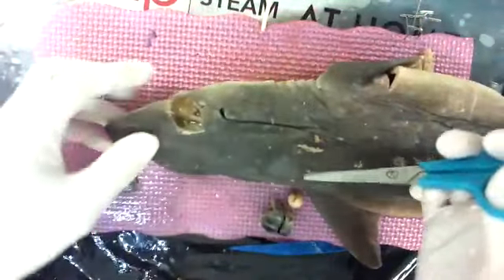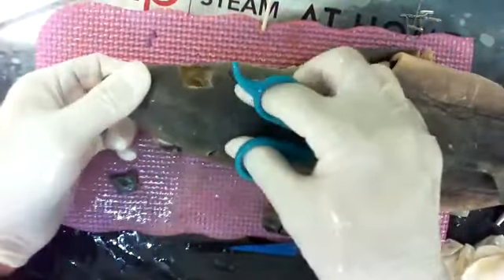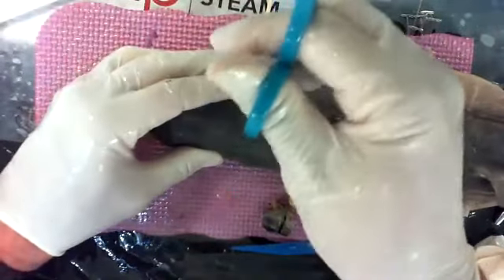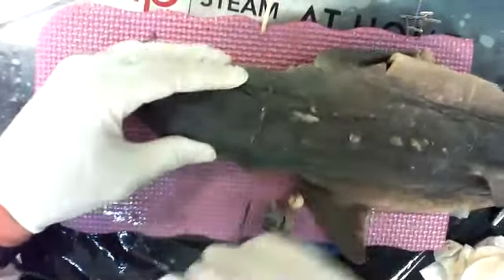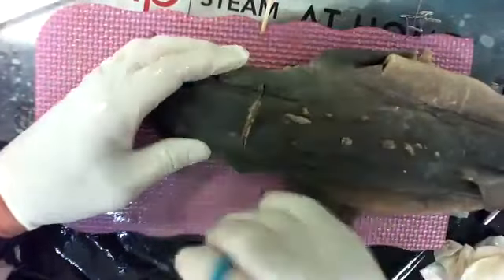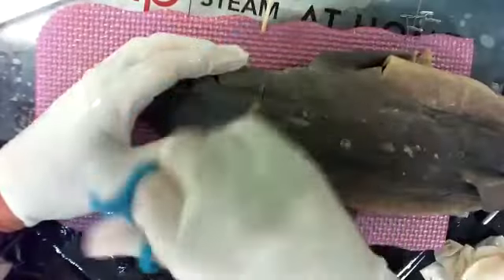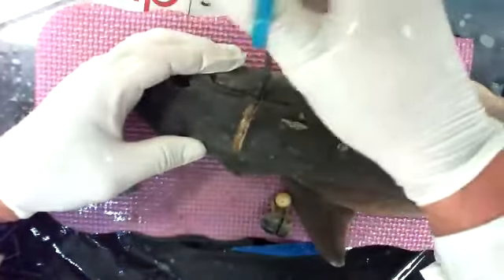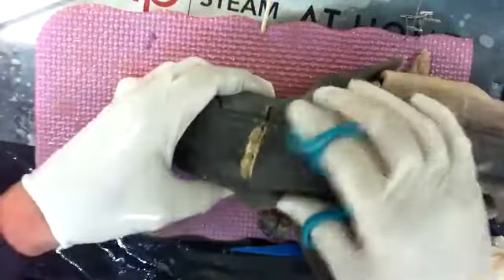But to get to the brain, there are two ways. You either can feel the neck right here, and then cut into the neck like that. So I'm cutting across. I'm going to do this kind of quick. I'm just cutting back and forth across. I'm cutting all the muscle, cutting down, and there's a bone right there.